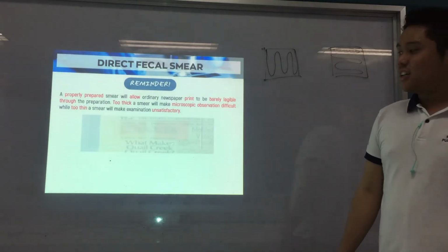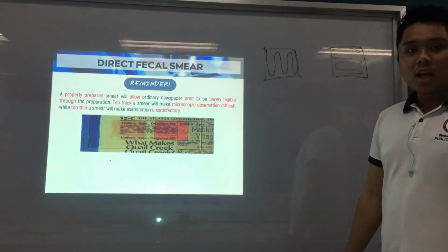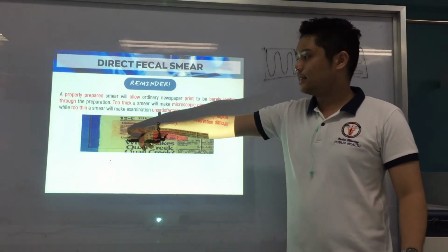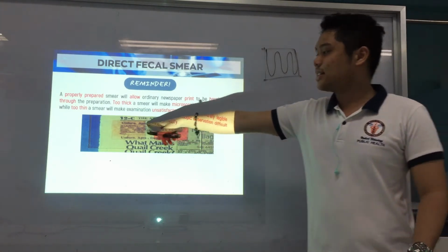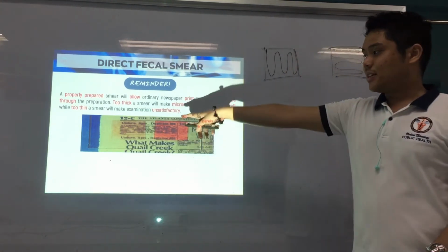Now here's an example of a prepared fecal smear. So this is the DFS, guys. This is before the D'Antoni's method. So this is the fecal DFS.